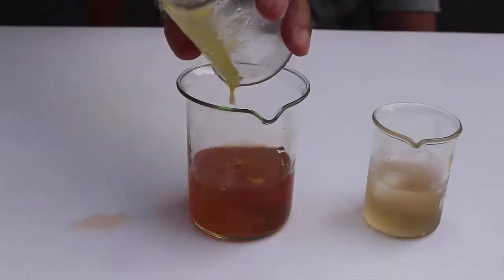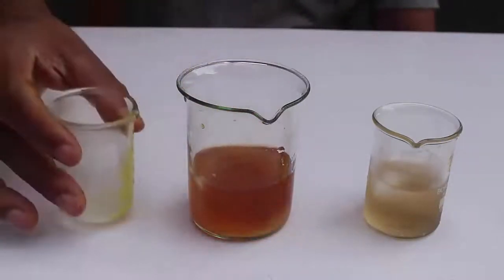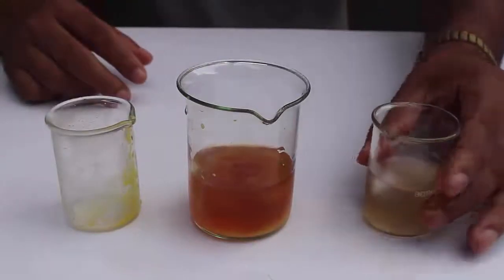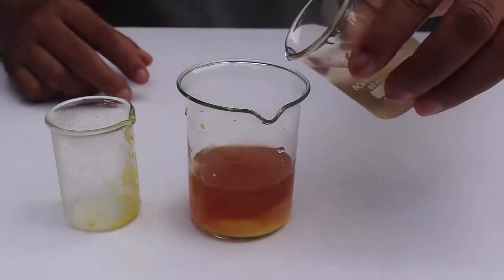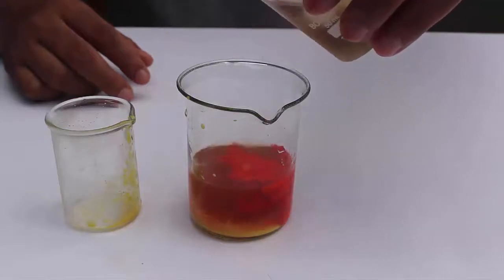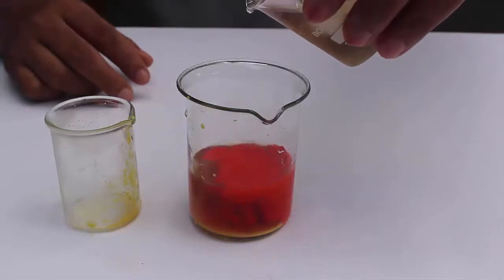Finally, in the end, pour the 2-naphthol solution in the big beaker. Now you will see a beautiful red colored precipitate.